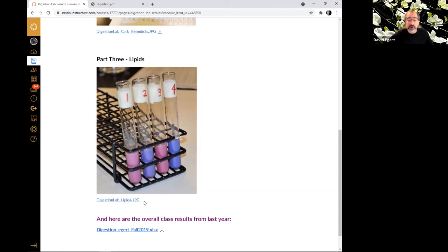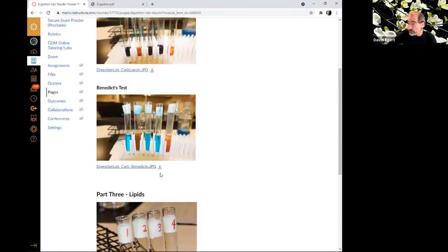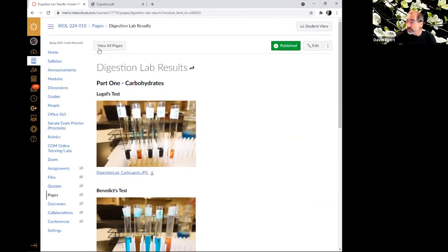But yeah, remember, there's 2 things. We have our hypotheses with the reasons, which is important, but then we have our actual data. And then what you're going to do is look at the relationship between those and how much the data supports your hypotheses or not. And the data is more of these assays looking at the breakdown or not. So that's the carbohydrates, that's the lipids.